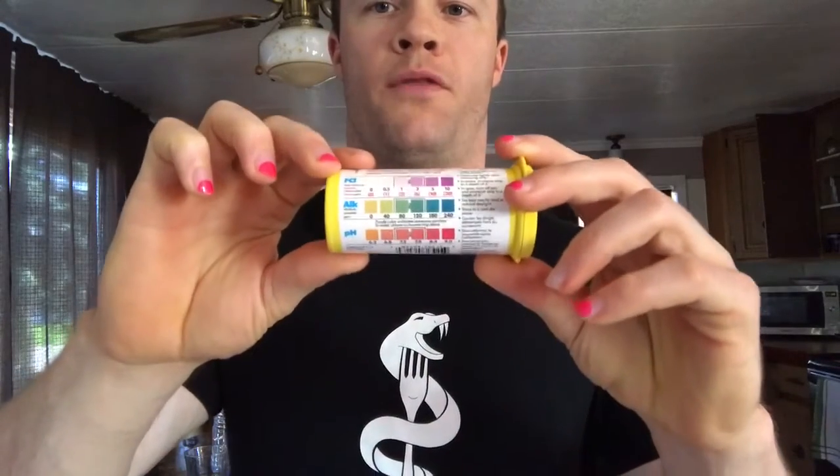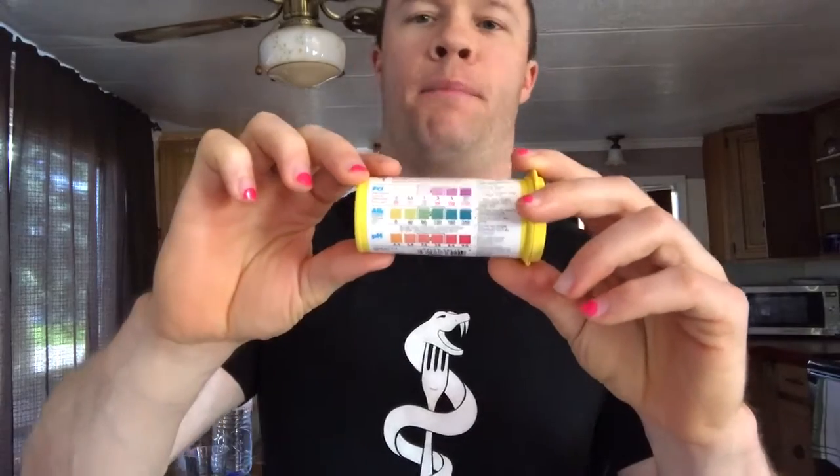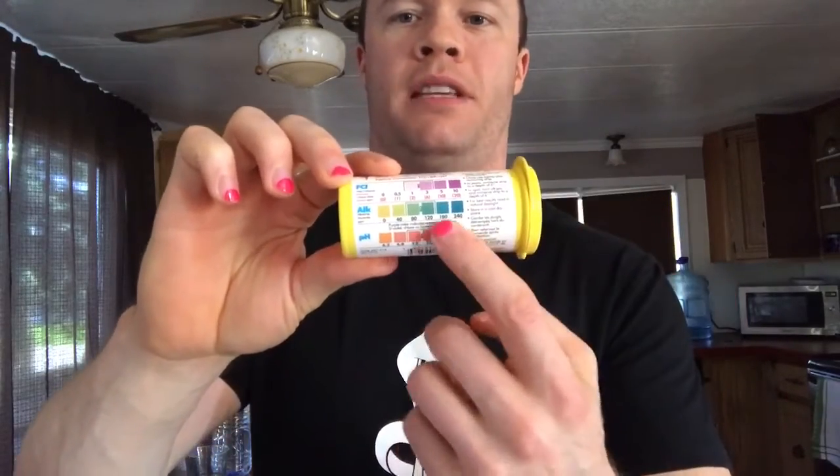So, before we get into this, I'm going to explain pH and alkalinity are not the same fucking thing, obviously, or there wouldn't be two color codes for each of them. pH is the amount of H+ ions in the water. You learned this in grade 12 chemistry. Alkalinity is the amount of dissolved ions in the water. Alkalinity is the water's ability to buffer acid, okay?